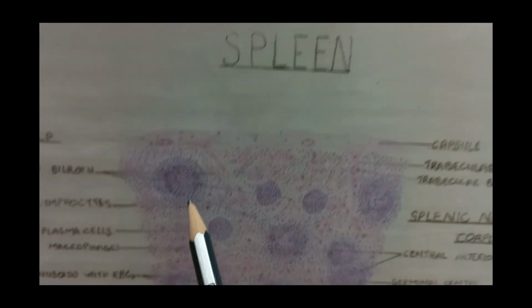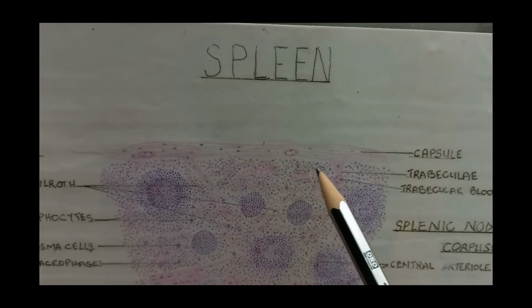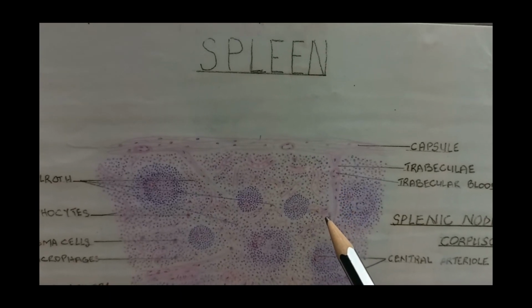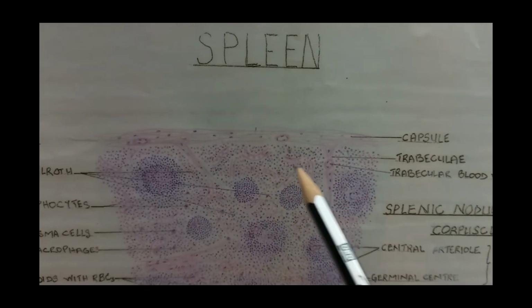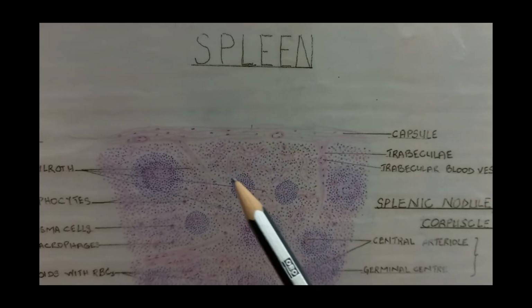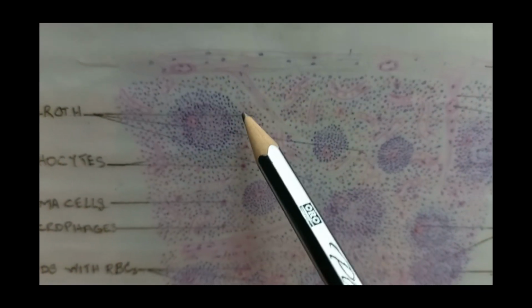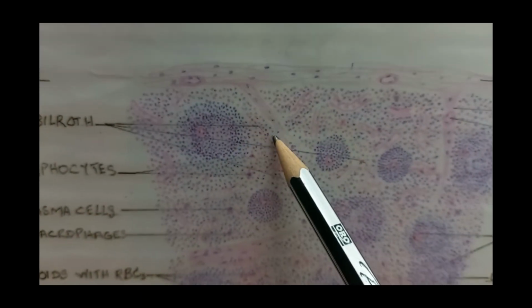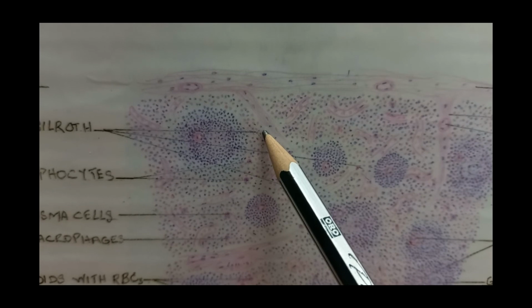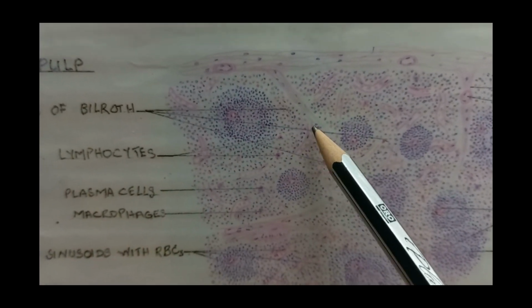So we discussed the spleen under a few headings: the capsule, which forms the trabeculae, which will divide the splenic pulp into incomplete compartments. Then we discussed the red pulp and the white pulp. In the red pulp, you will find the splenic cords, which are known as the cords of Billroth, and the sinuses.